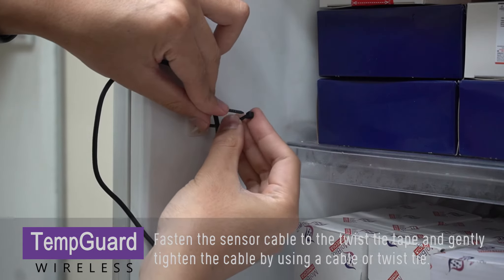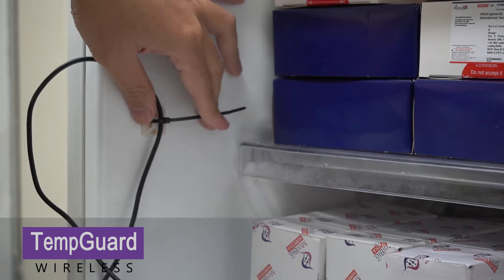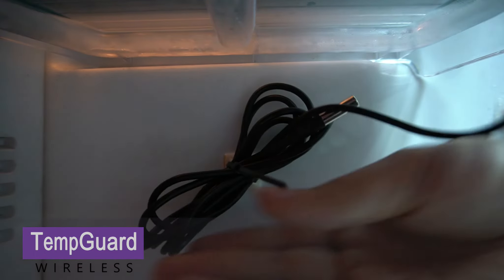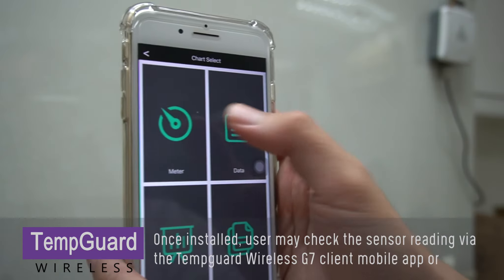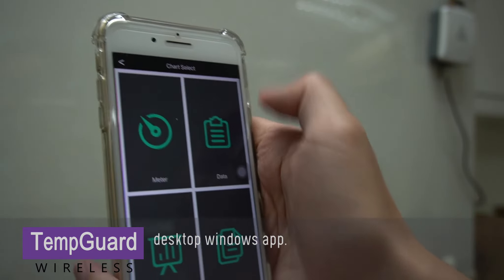Using a cable or twist tie, tie the extra cable together with the sensor and fasten it on the twist tie tape. Once installed, users may check the sensor reading via the Temp Guard Wireless G7 client mobile app or desktop Windows app.